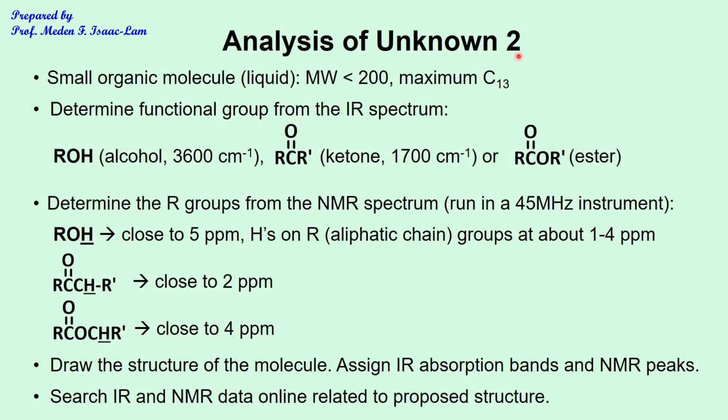Analysis of second unknown. This unknown is a small organic molecule and it's a liquid. Molecular weight is less than 200. Maximum number of carbons, 13.